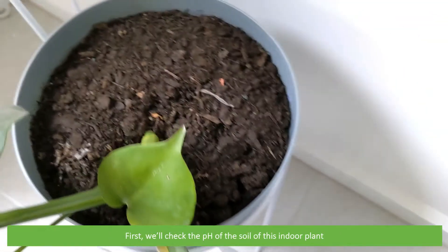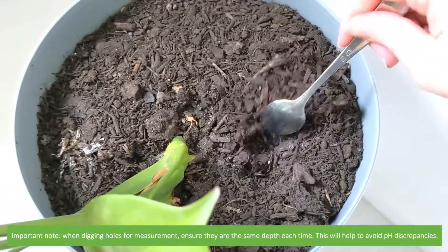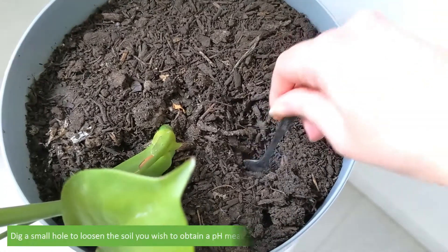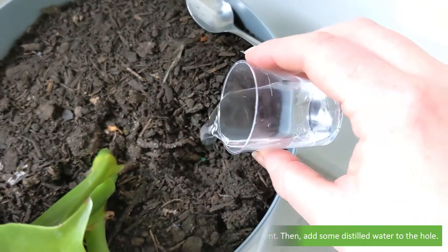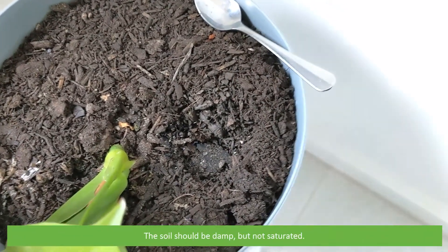First we'll check the pH of the soil of this indoor plant. Important note: when digging holes for measurement, ensure that they are the same depth each time — this will help to avoid pH discrepancies. Dig a small hole to loosen the soil you wish to obtain a pH measurement in, then add some distilled water to the hole. The soil should be damp but not saturated.